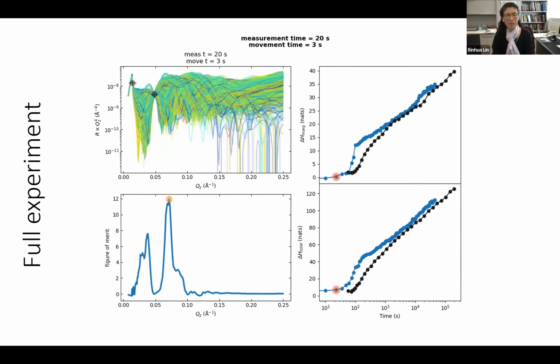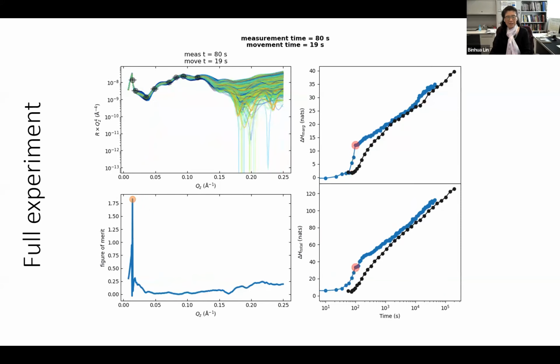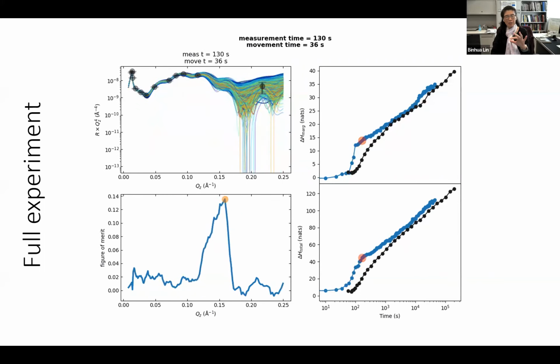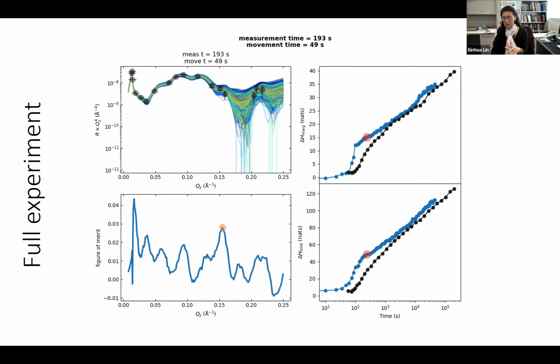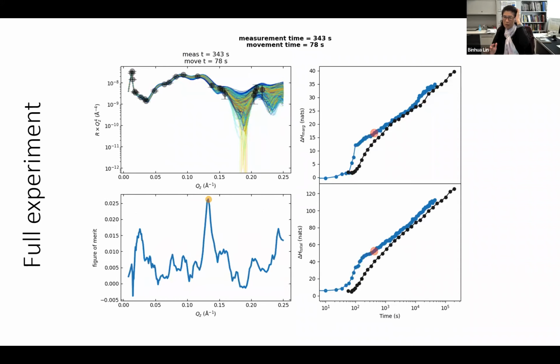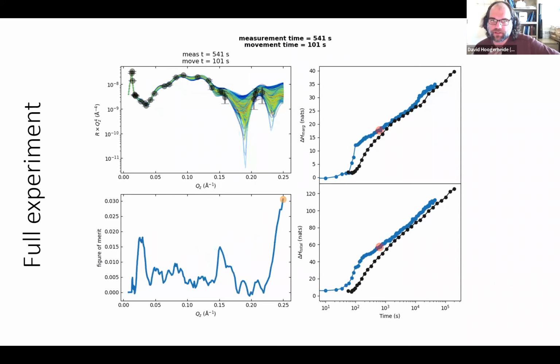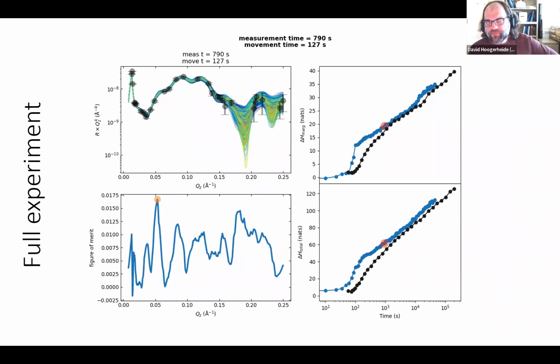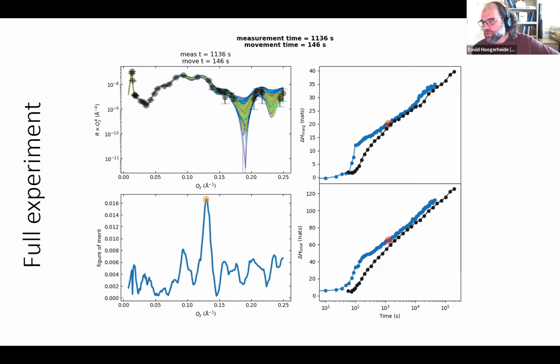David, I have a question also about this data taking. I'm very ignorant in neutron scattering. In your measurement, the whole measurement, you don't need to attenuate the intensity for the detector. Is that right? The whole intensity range fits your dynamic range of detectors. That's correct. Now, if you did need to attenuate it, usually you would take that into account in your data reduction process, so you would know whether you put an attenuator in or not.